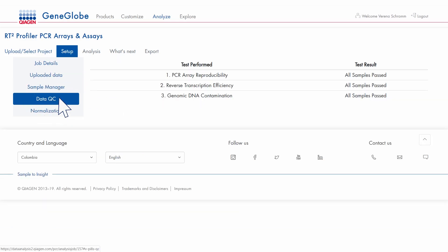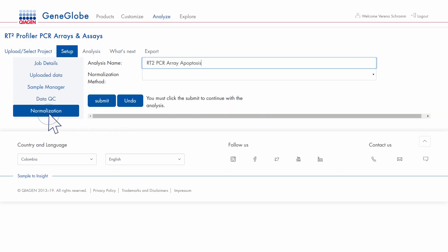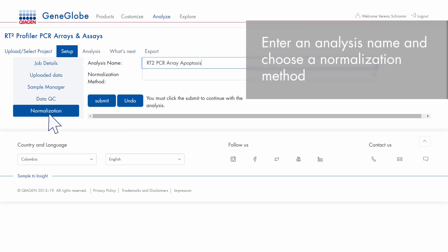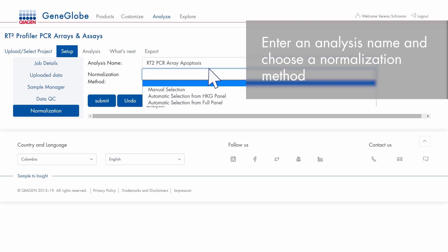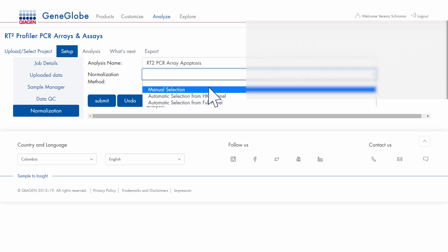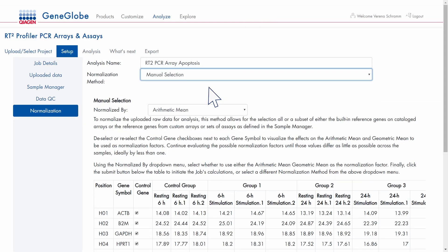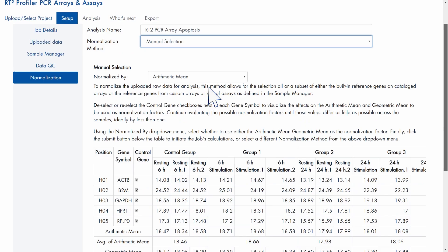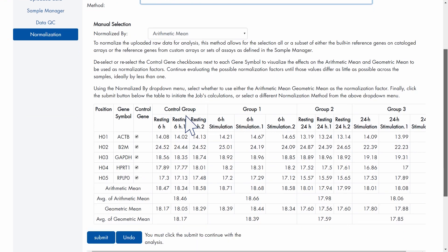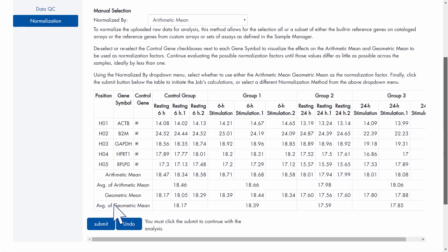Check the performance of your control assays. Enter an analysis name and choose a normalization method. If you are satisfied, proceed.